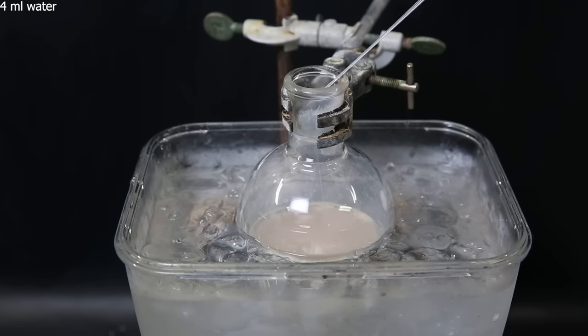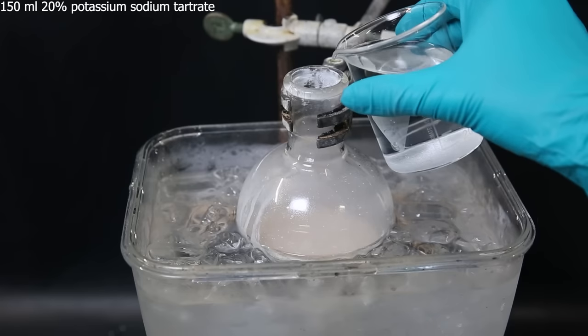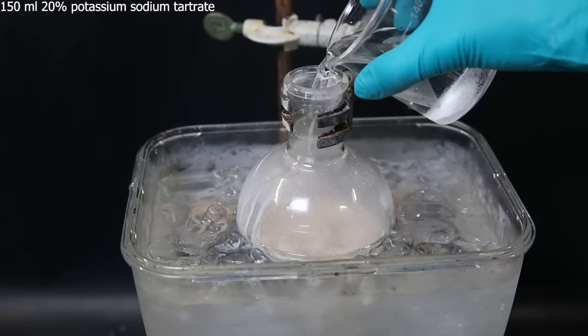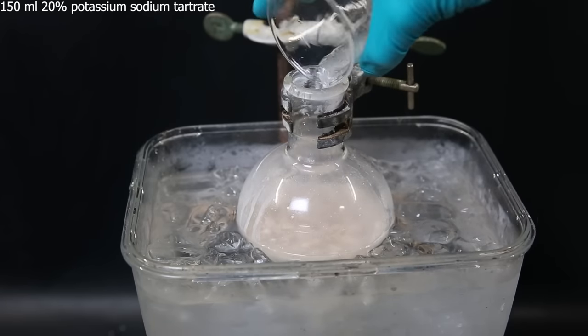Now to destroy any remaining lithium aluminum hydride, I drop-wise add 4 ml of water to the flask. When that is done, I quench the mixture with 150 ml of a 20% potassium-sodium tartrate solution.